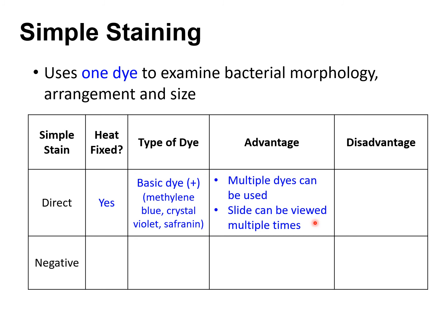And as I said, when you heat fix, you're killing the bacteria and you're permanently adhering it to your slide. Therefore, you can actually save your slides if you want to view them at a later time. Saving your slides is great because you can view them multiple times. So that's definitely an advantage.